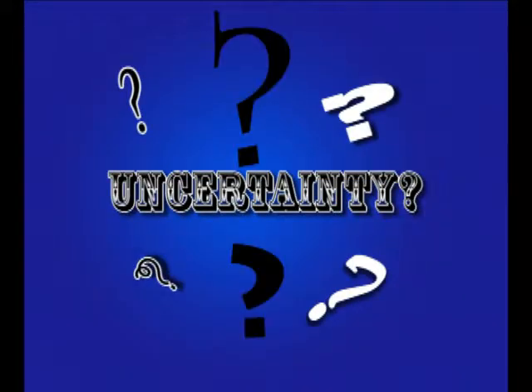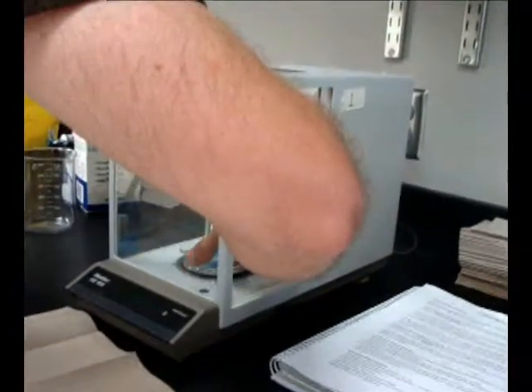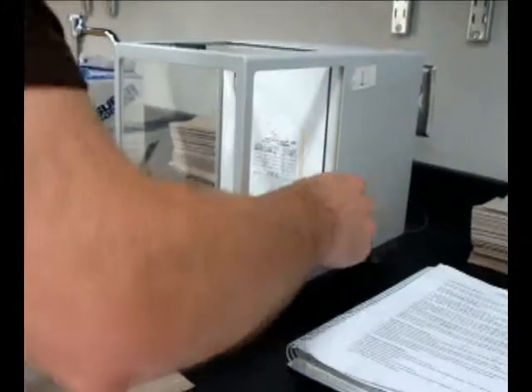It is important to find the uncertainty of your measurement device for the purpose of reporting your findings. To do this, place a sample on the pan and close the doors. Observe the fluctuations on the readout and record the minima and maxima of these fluctuations in your notebook. The result of this calculation is your uncertainty and should be reported along with your measurements as plus or minus your value — in this case, plus or minus 0.0003.